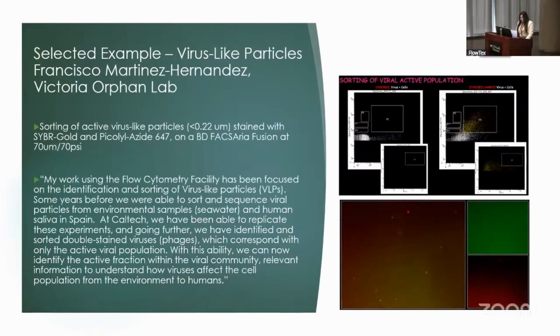All right. So flow cytometry is a cultivation-independent technique for microbiome analysis to evaluate both human and environmental samples. Existing knowledge around evaluating microbiomes in different systems is limited by the fact that many microbes are not suitable for culture.